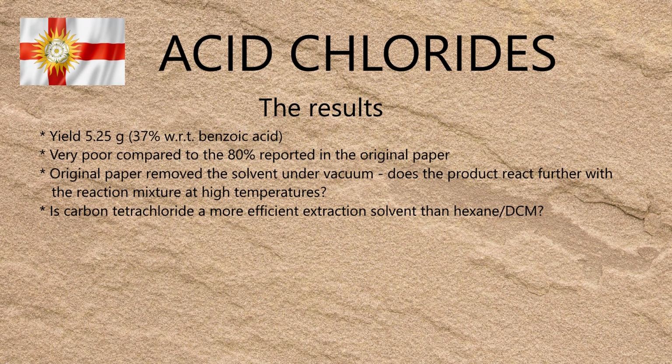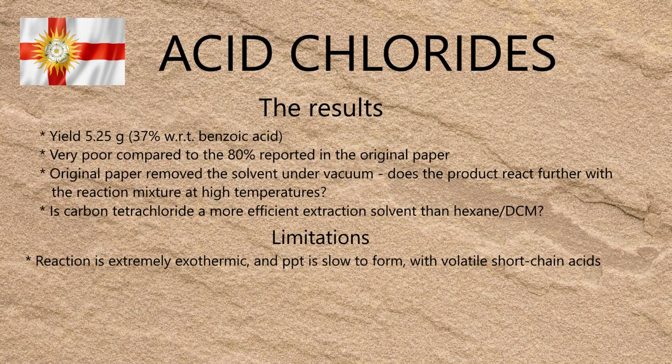This aside, the reaction is simple and practical and tremendously useful for amateurs, provided you can get hold of cyanuric chloride. It does, however, have a few key limitations. I mentioned earlier that the reaction is quite exothermic. With shorter chain, more volatile acids, it is very exothermic.